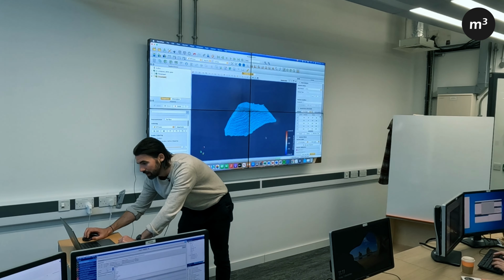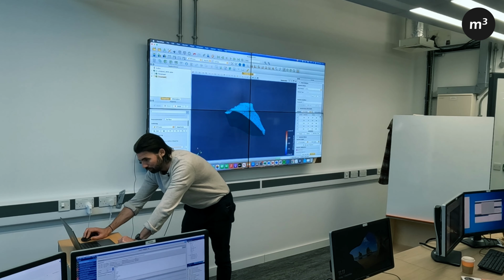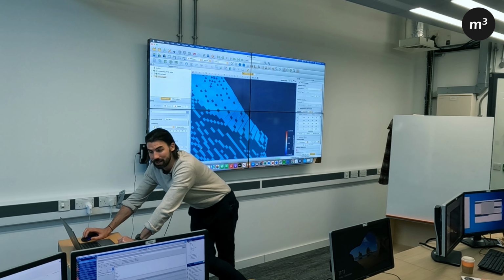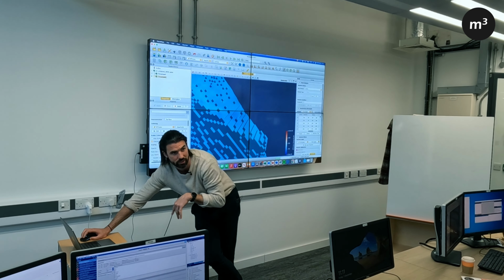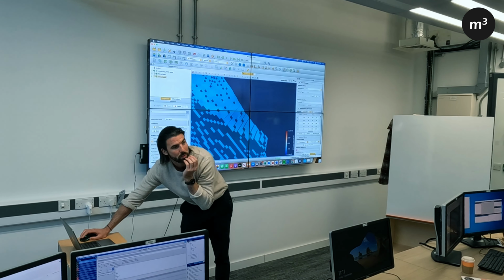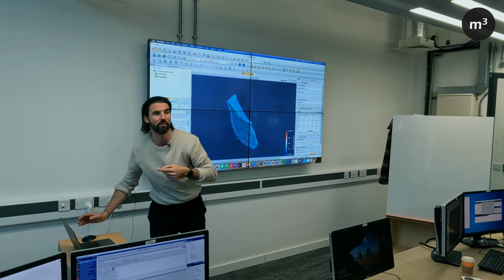Okay, so that's kind of basic visualization. There's obviously a lot more you can do. One thing you will notice is this voxelized surface, obviously from the EBSD data, is voxelated. So after lunch we'll talk about how you can mesh this surface to get a smoother grain surface and start to look at grain boundary properties. But yeah, that's basic visualization. Hopefully that'll give you enough to play with.